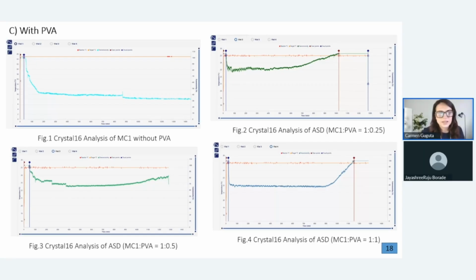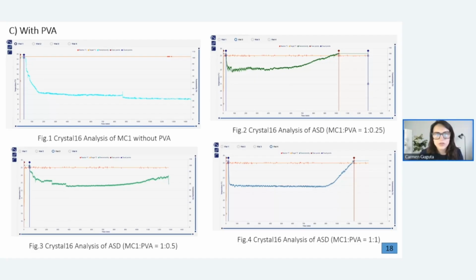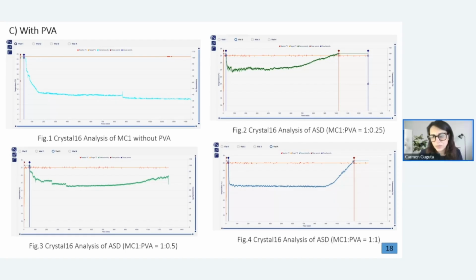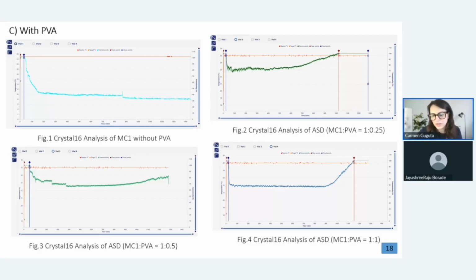Somebody else is saying something. Is it helpful in screening the polymer to also look for high drug loading? If you do such polymer amorphous solid dispersions, is it useful also to consider high drug loadings? Can you answer that?